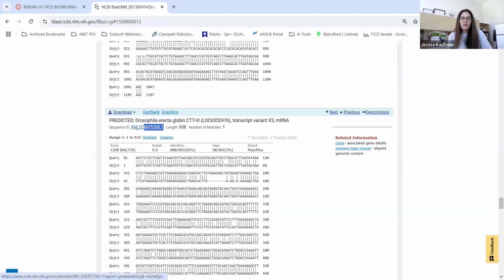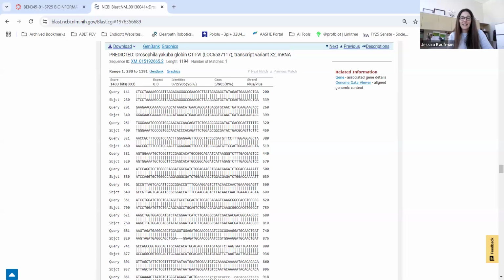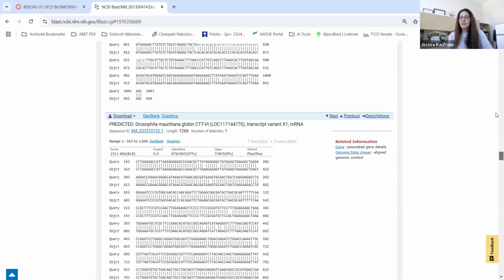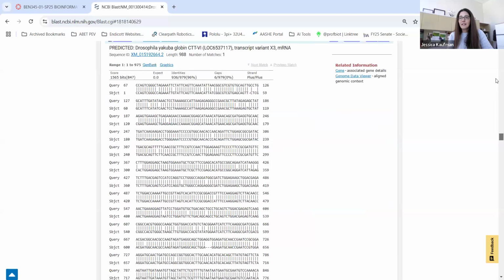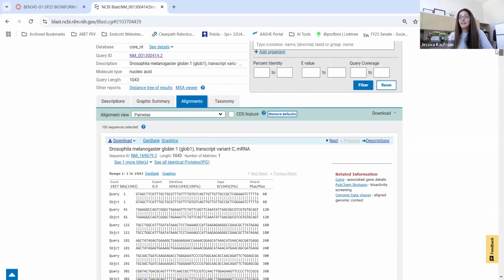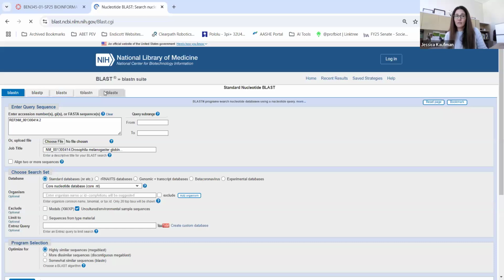And I can also copy this sequence to do the second kind of BLAST search. So if I don't know what will be a good match in the database, I'll often align the sequence not to an individual piece of data, but I'll align it to the database and find that huge table and get all of the search results.